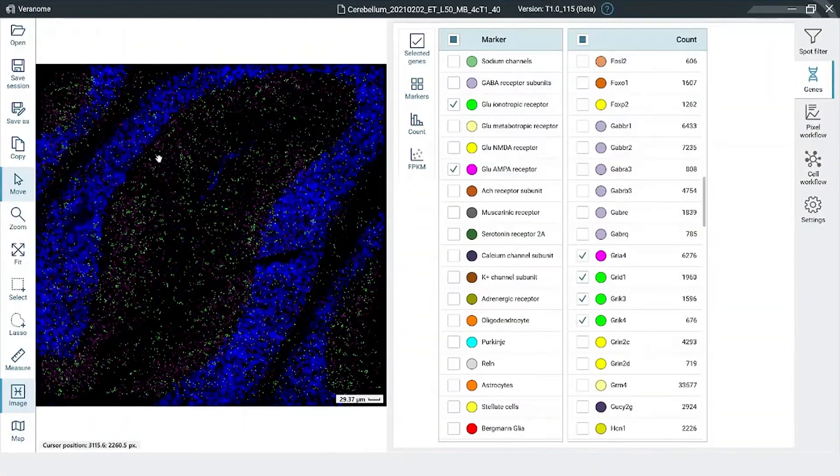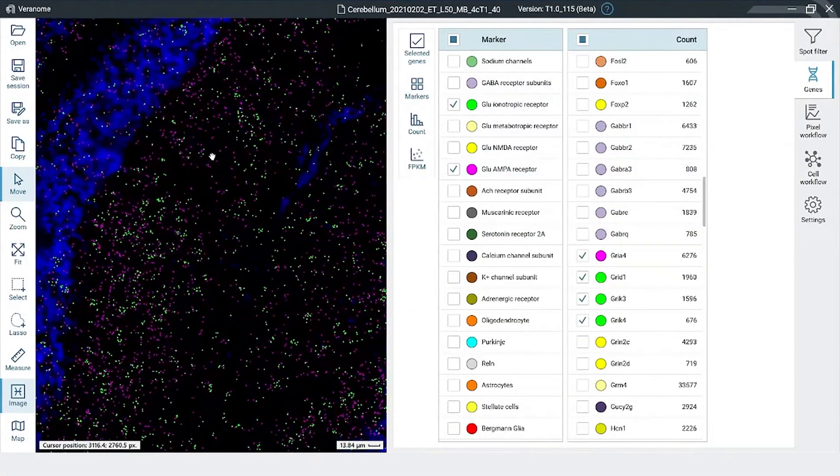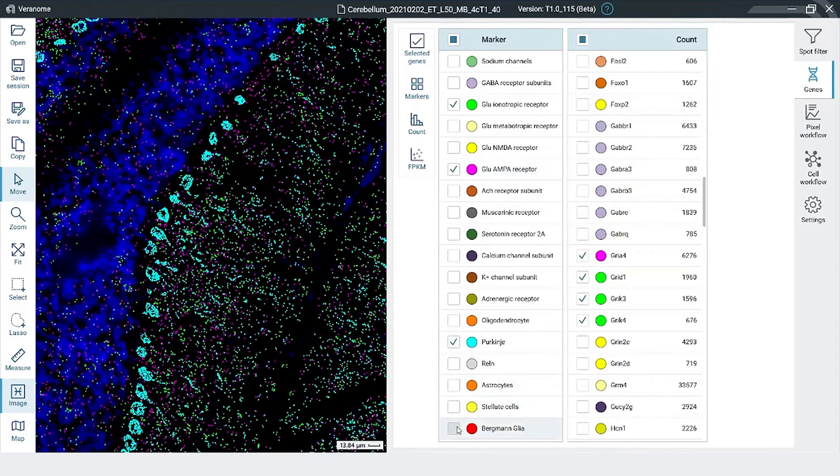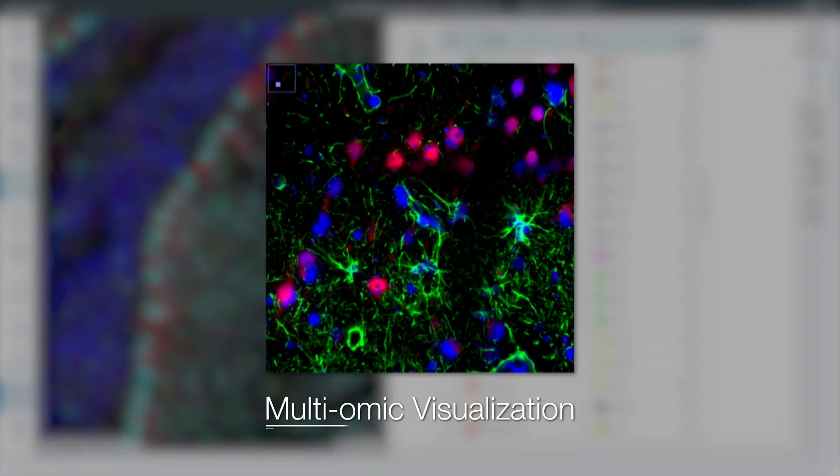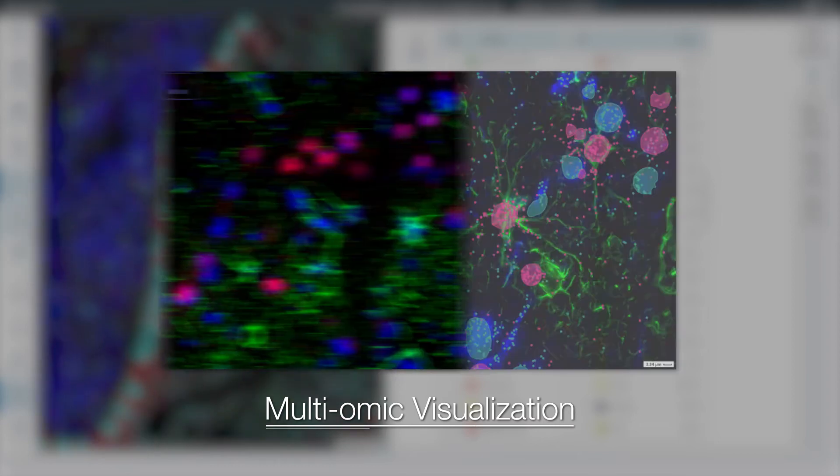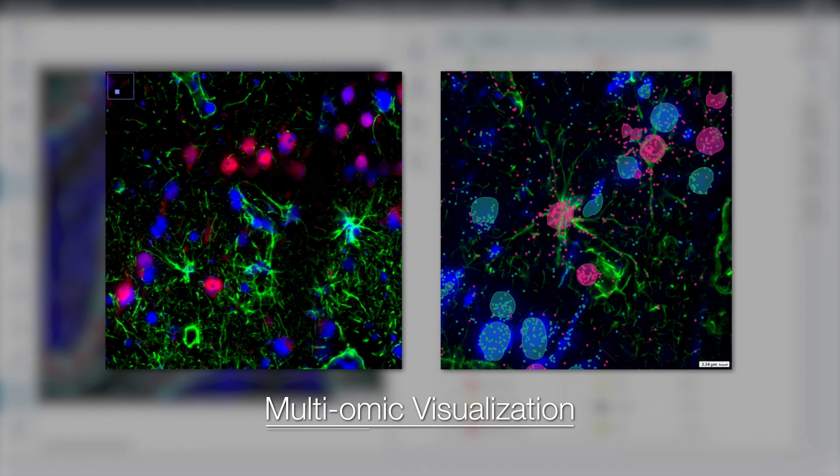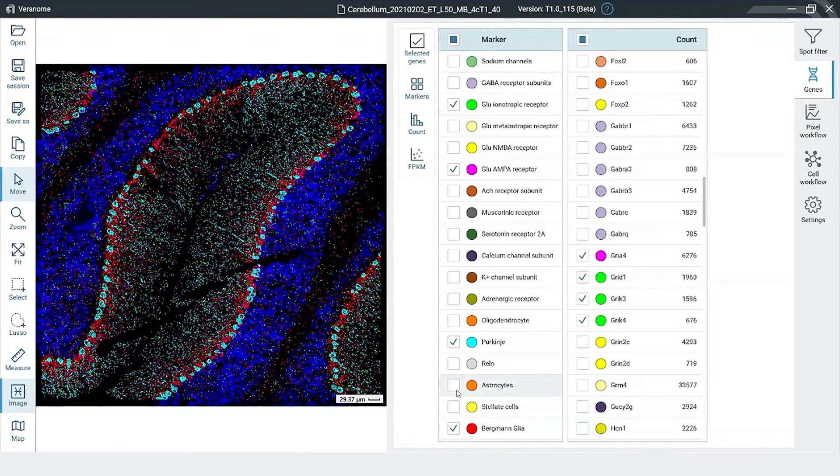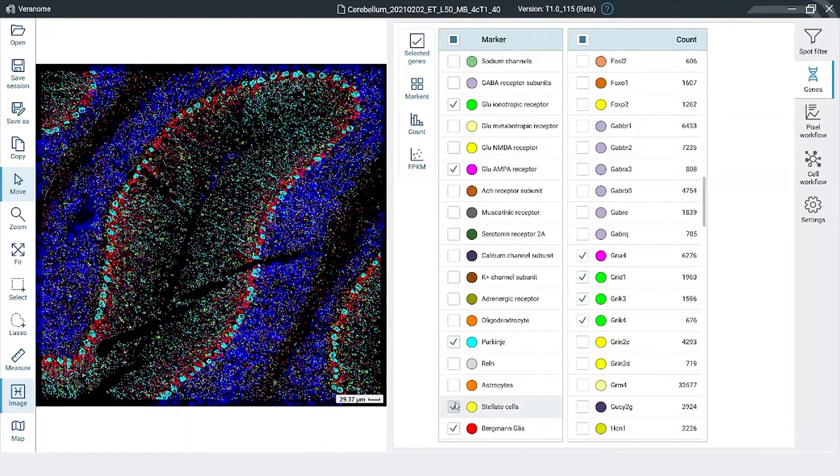The raw images from the system are converted to RNA spots by the built-in software. These decoded RNA spots can be visualized as cell type clusters together with immunofluorescent stains and merged for multi-yomic analysis in Veranome's analytics software.